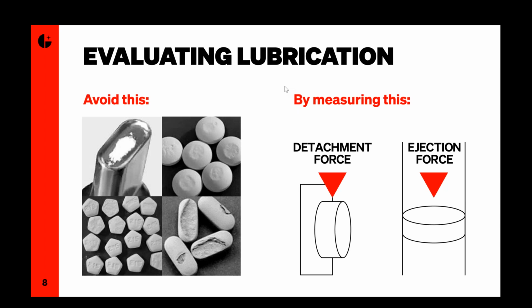We also carry out a lubrication evaluation as part of our compaction analysis. This isn't covered by the recommendations from 1062. But of course, if you want to avoid sticking and picking, you have to have a well lubricated blend. So we've developed a method of evaluating how well lubricated the blend is.